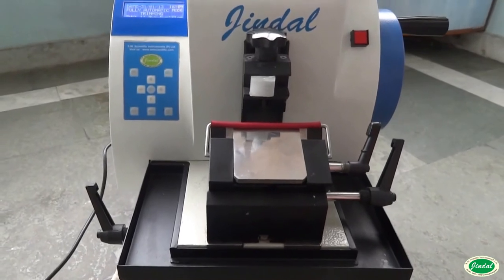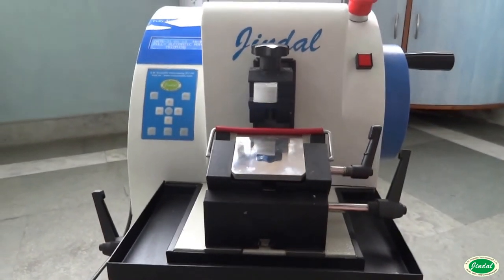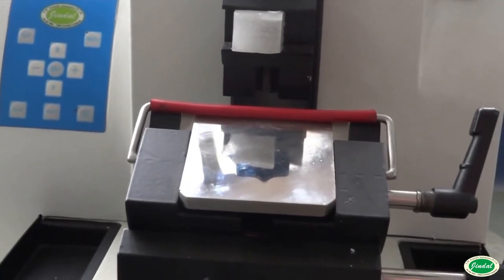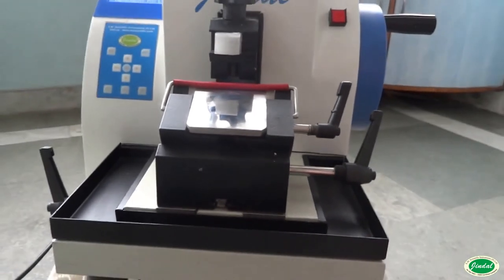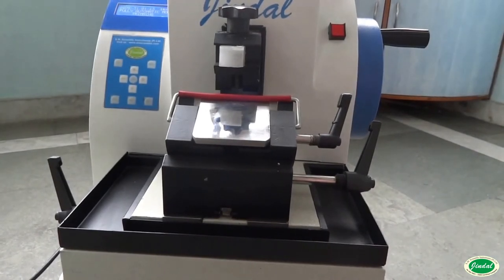It includes a combination of automatic motorized hand wheel movement and high-precision motorized specimen feed, which provides efficient operation with the most section reproducibility. Protection in the fully automatic microtome is assured by an incorporated finger protection guard of the knife holder that exceptionally safeguards the blade edge.